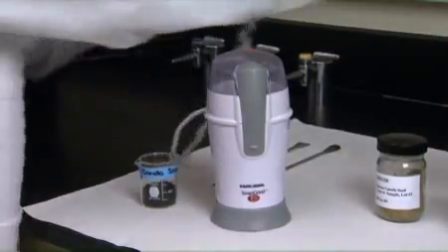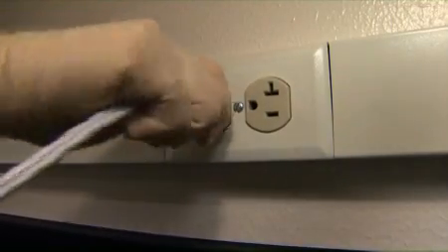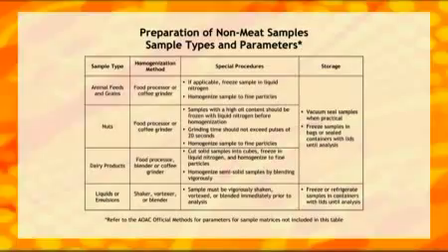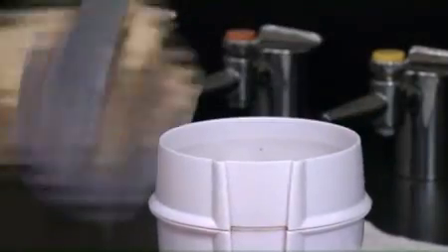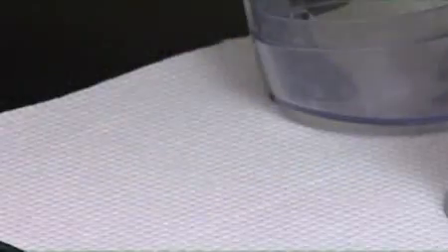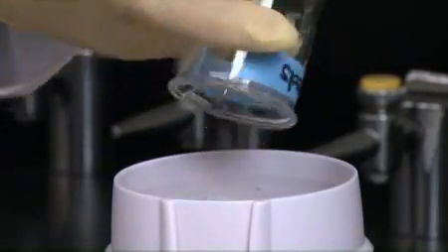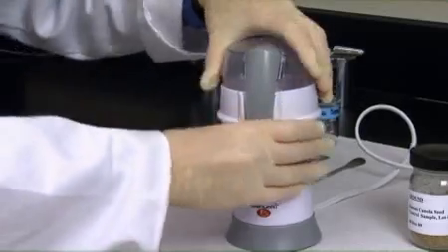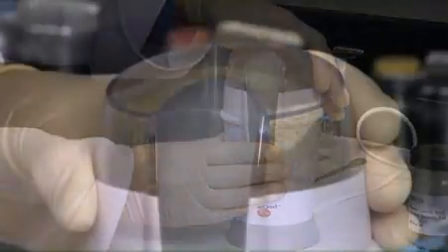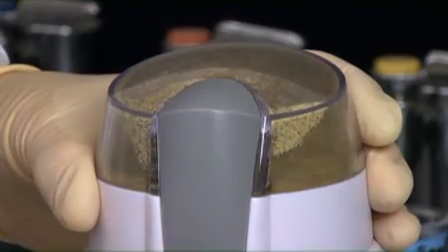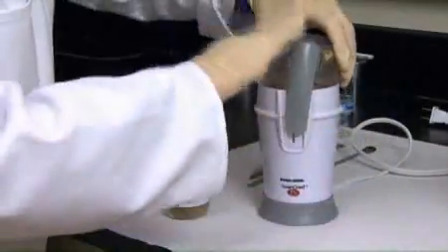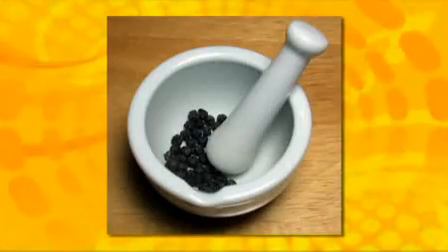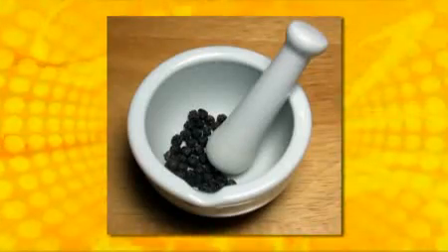Our third example of sample preparation is a canola seed sample. For non-meat samples, refer to the parameters in this chart. As with all other samples, the goal is to create smaller pieces of material so that the mixture is as homogeneous as possible and to present a large surface area. A coffee grinder or a food processor will chop and mix the sample simultaneously. Use pulses of 20 to 30 seconds until the sample resembles powder. Continue to grind the entire sample and combine the ground portions if applicable. It is strongly recommended that dry, powdered samples be further homogenized with a mortar and pestle.